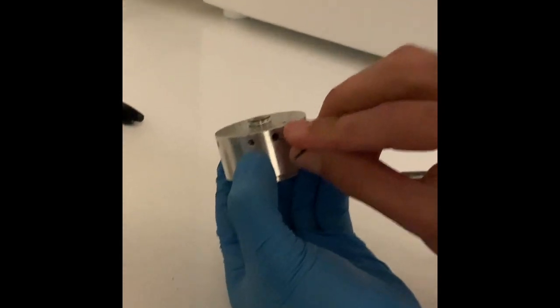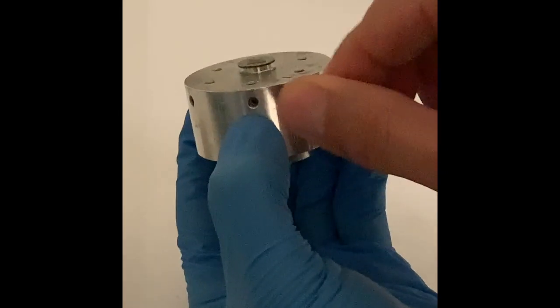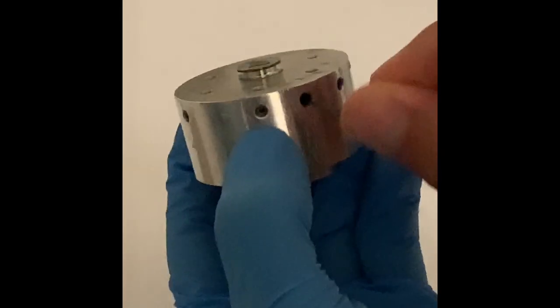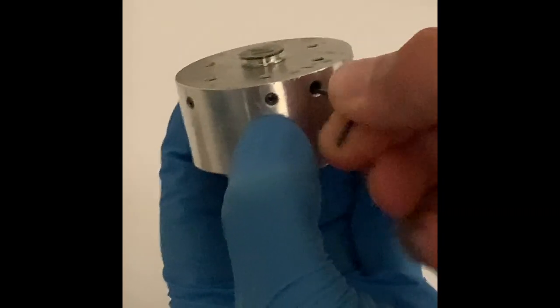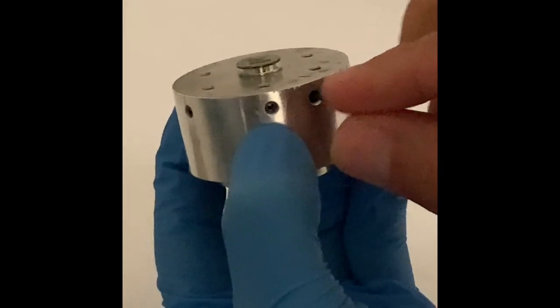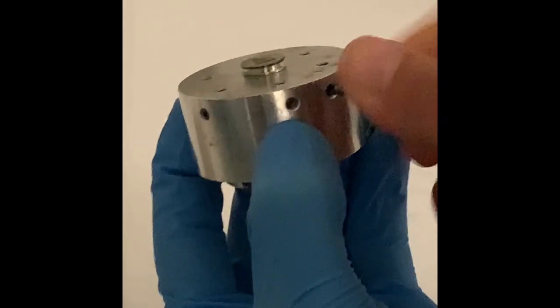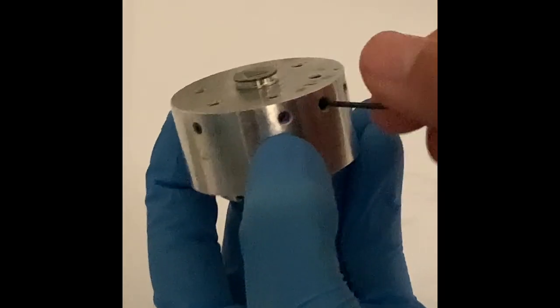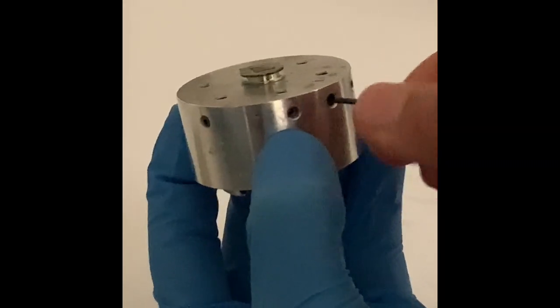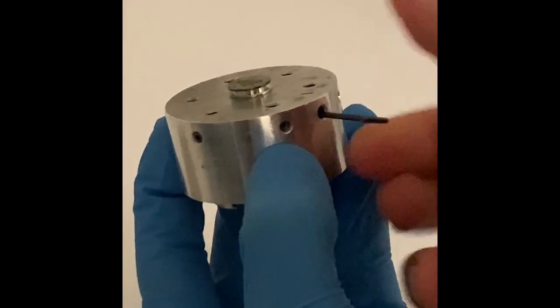Gently tighten the hex screws using the key. Do not over tighten these screws. Do not place silver paint or tape directly on the holder.